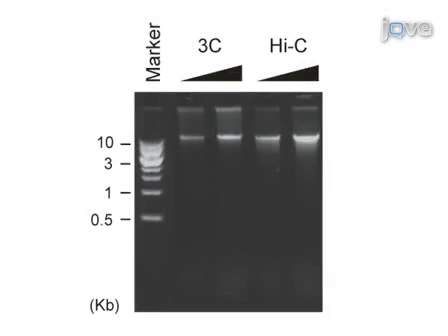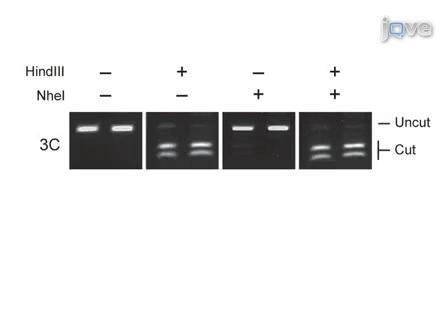Quality control steps should reveal that both 3C and Hi-C libraries run as rather tight bands larger than 10 kilobases. A DNA smear indicates poor ligation efficiency. Typically, ligation efficiency is slightly lower in a Hi-C library as compared to a 3C template. Hi-C marking and ligation efficiency can be estimated by digestion of a 3C PCR product.